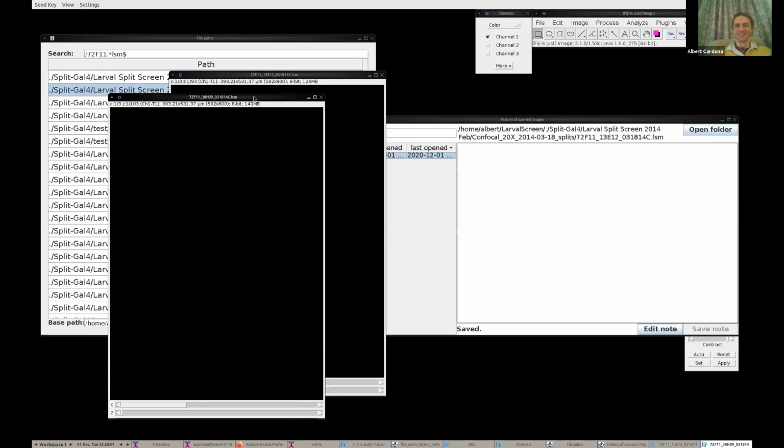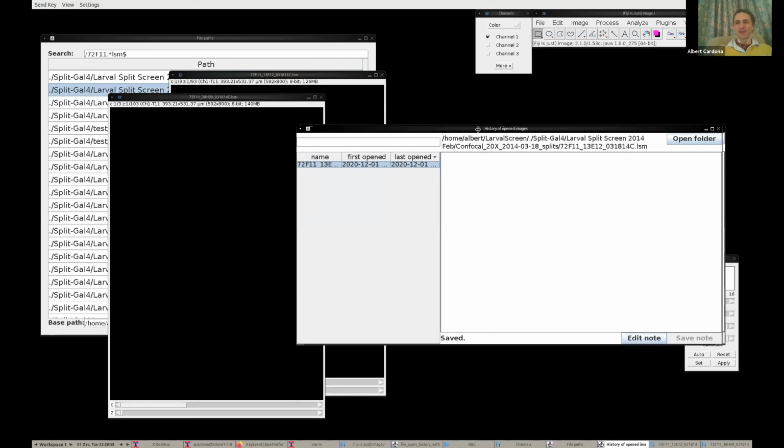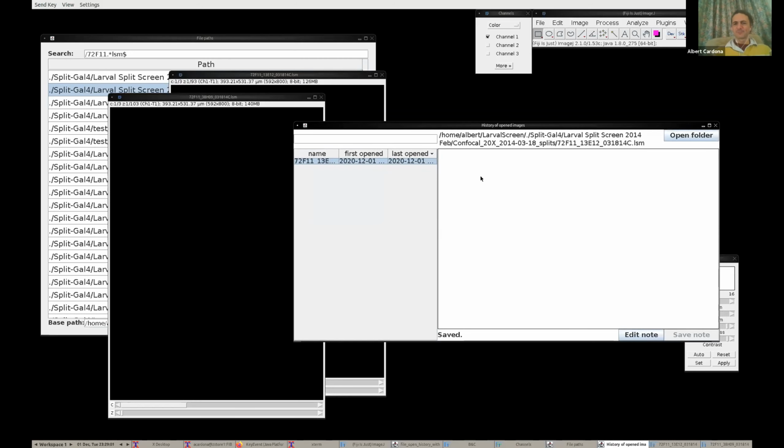Brilliant. How is this not working? Goodness. I'm running out of energy to debug this right now live for all of you. But basically, I will look at this later and try to find out what happened in my local copy here. Why can it not work when it should?